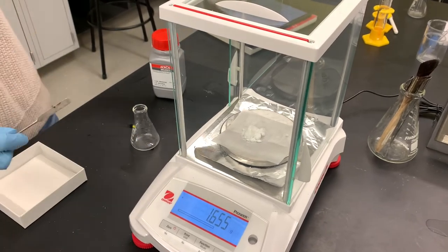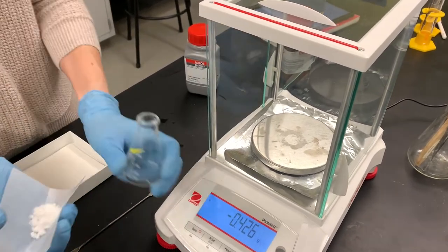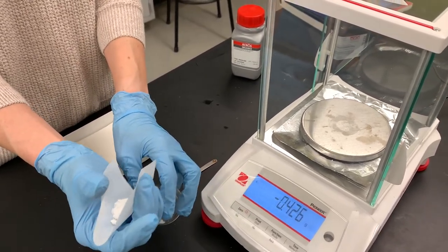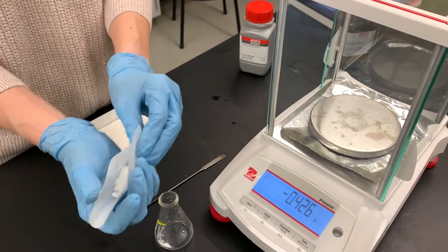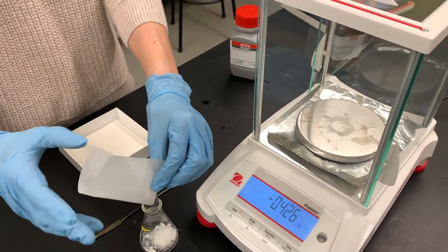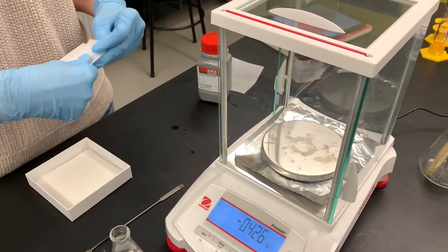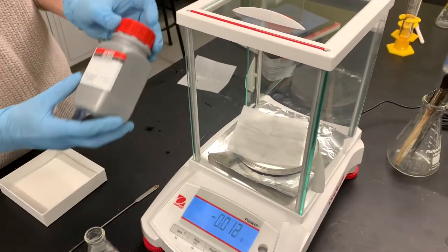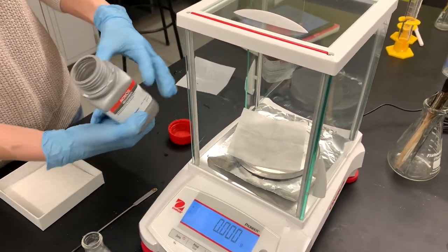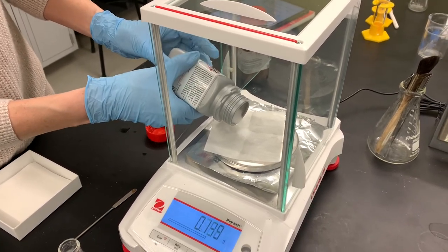And also, in addition to the vanillin, which I'm just going to put straight into this little 50 milliliter Erlenmeyer flask, we're also going to be measuring out a second dry reagent that we'll use, which is potassium bromate. The potassium bromate is not going to go into the flask right now, but we'll measure it out now while we're at the balance. Potassium bromate, KBrO3, we need about 0.75 grams. And then, like I said, this ingredient we'll be adding later.